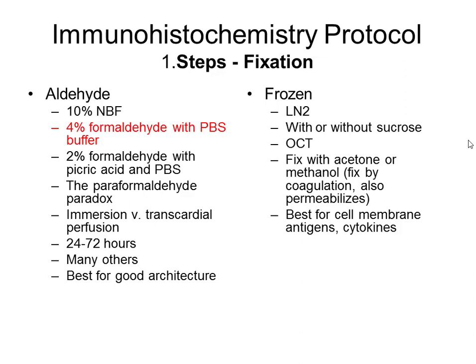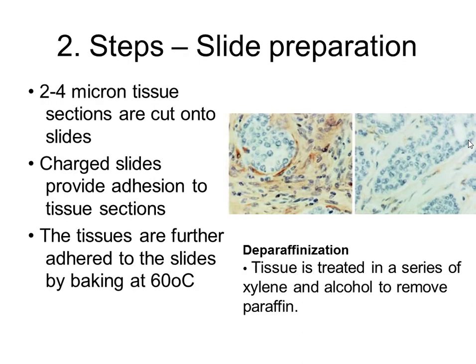After that, we put this prepared tissue sample into the paraffin, and paraffin fixes the tissue, and we may cut it. For the cutting of the tissue sample, we use a microtome, which cuts the tissue into 2-4 micrometer pellicles, and we put these pellicles onto the slide.